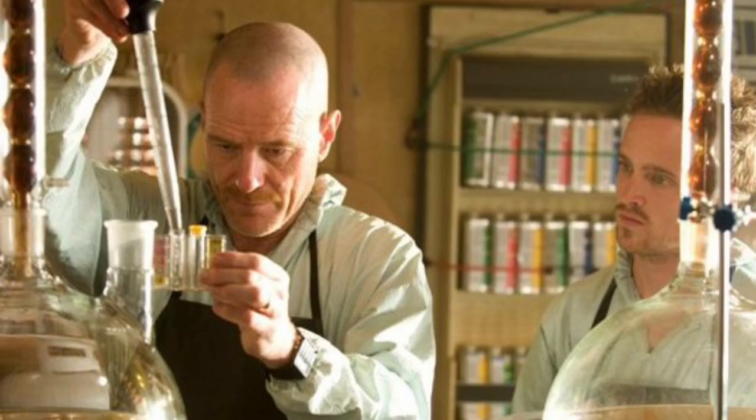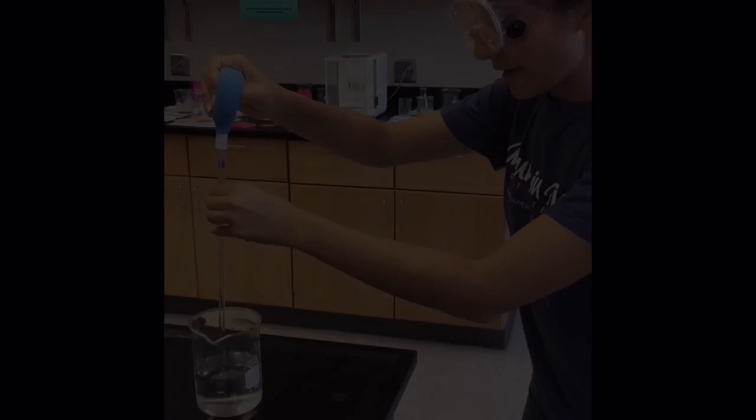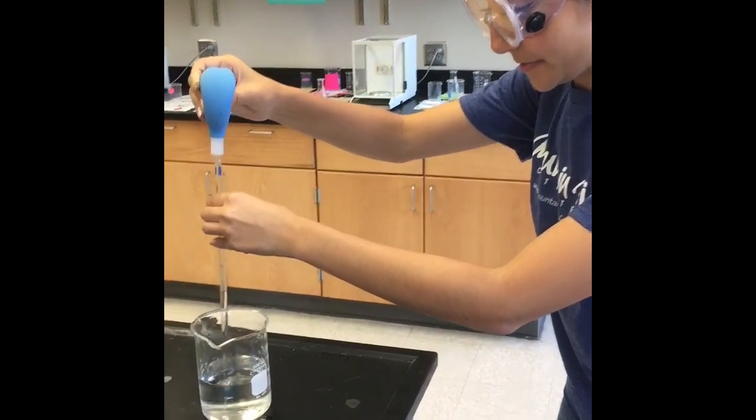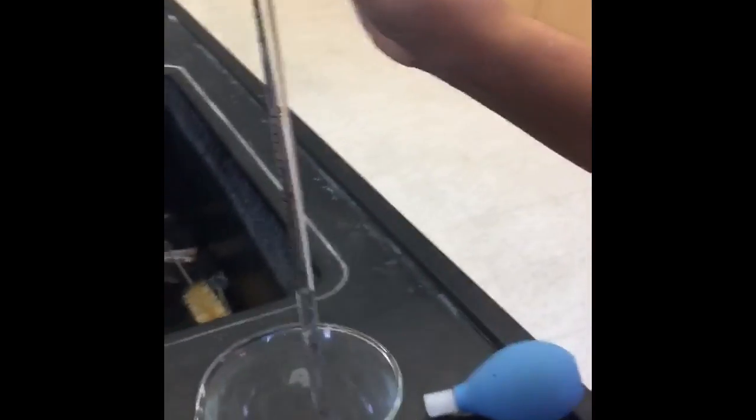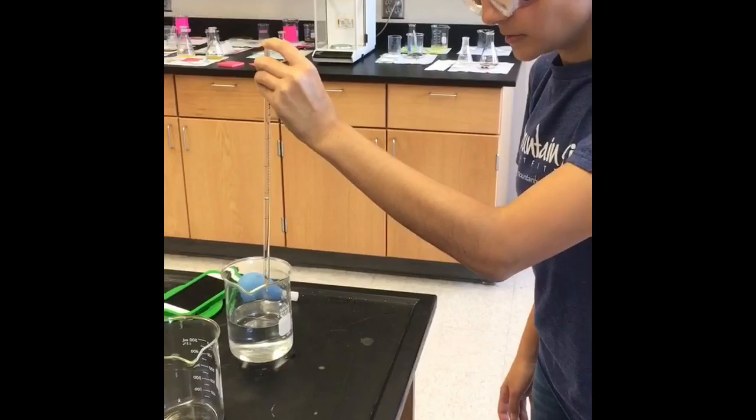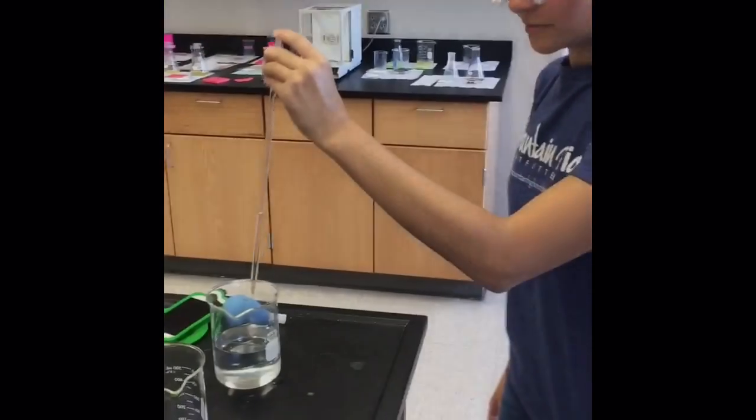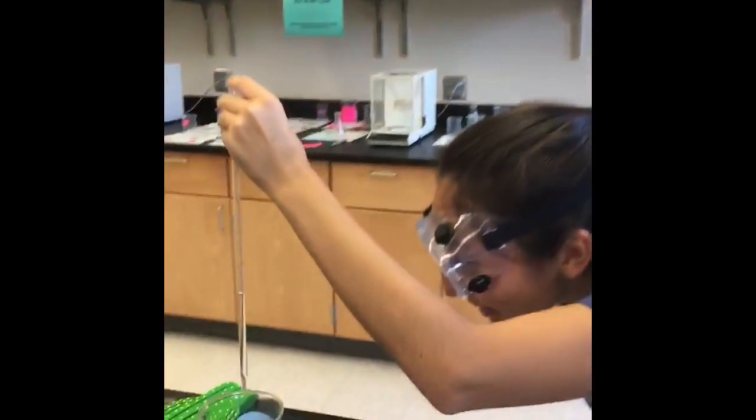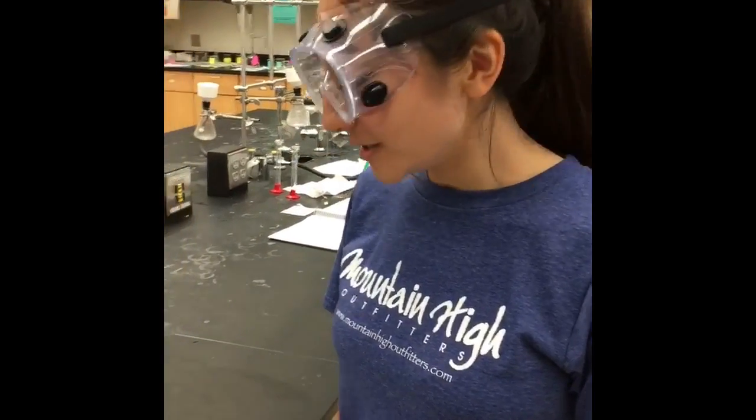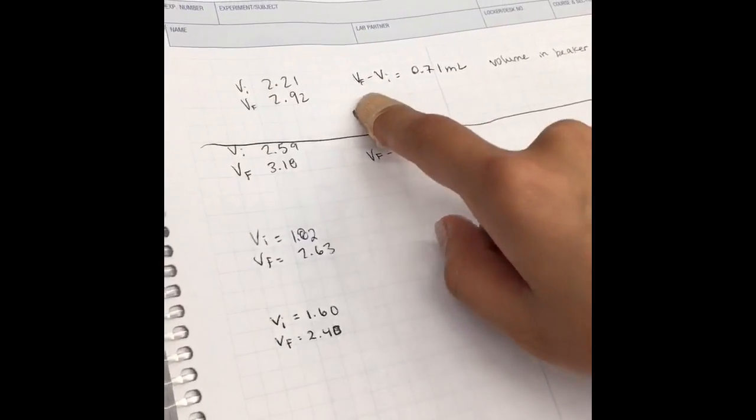Let's take a look at how Amy measures volume from a pipette by reading from the meniscus. The initial volume is 2.21. The final volume is 2.92. The volume of the beaker amounts to be 0.71 milliliters, and I found that by subtracting the initial volume from the final volume.